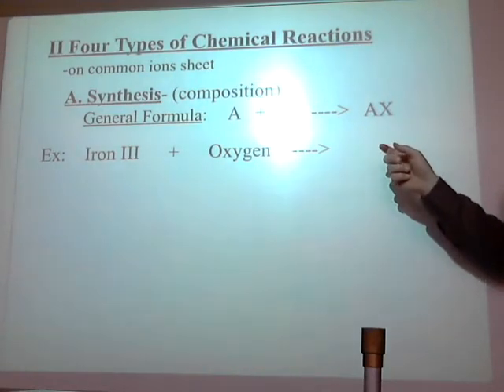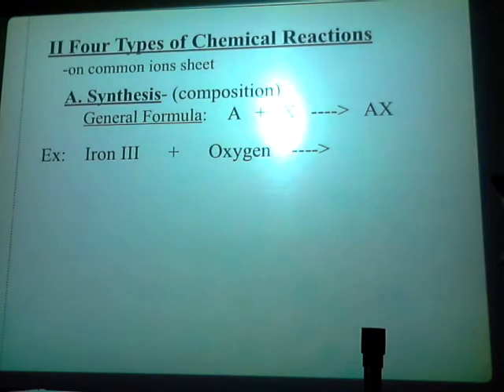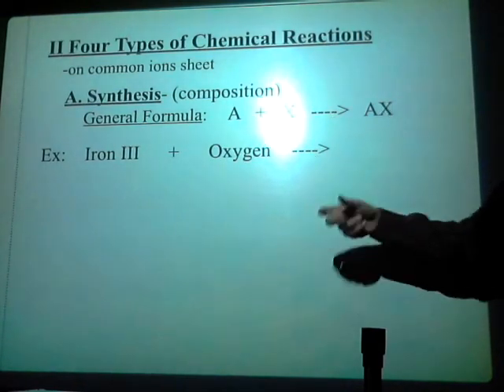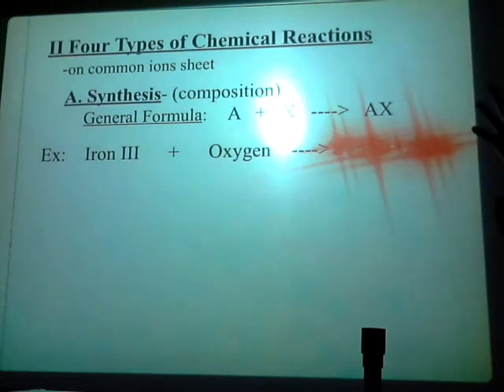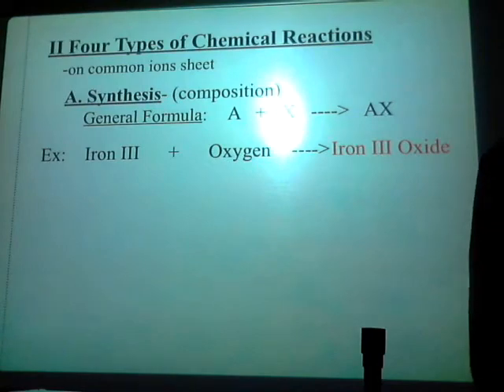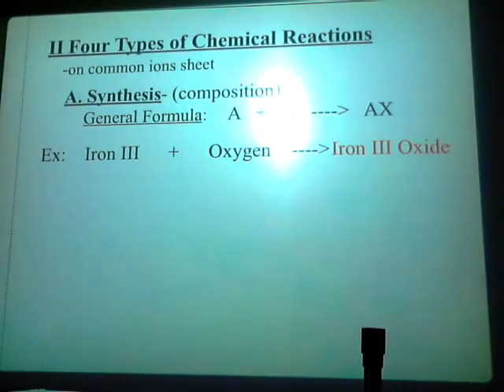Look at it. Put the light off again because you got to have it off for this. Iron 3 plus oxygen yields, what do you think? Iron oxide. Iron 3 oxide? Watch. It's going to burn. That's how it is. See? That's right. Iron 3 plus oxygen yields iron 3 oxide. Now, I want you all to try to do that one on your own. You can hit that backlight on, please.